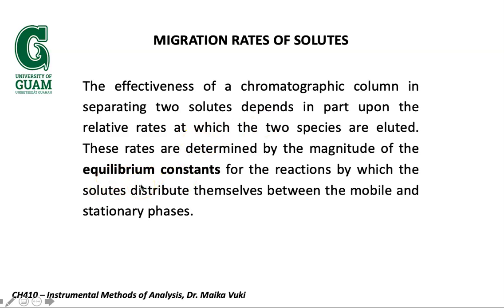As I mentioned from the start, the equilibrium conditions are what really govern a lot of these processes that take place in the separation. In the equilibrium constant, we are basically looking at the distribution of the analyte between the mobile phase and the stationary phase.